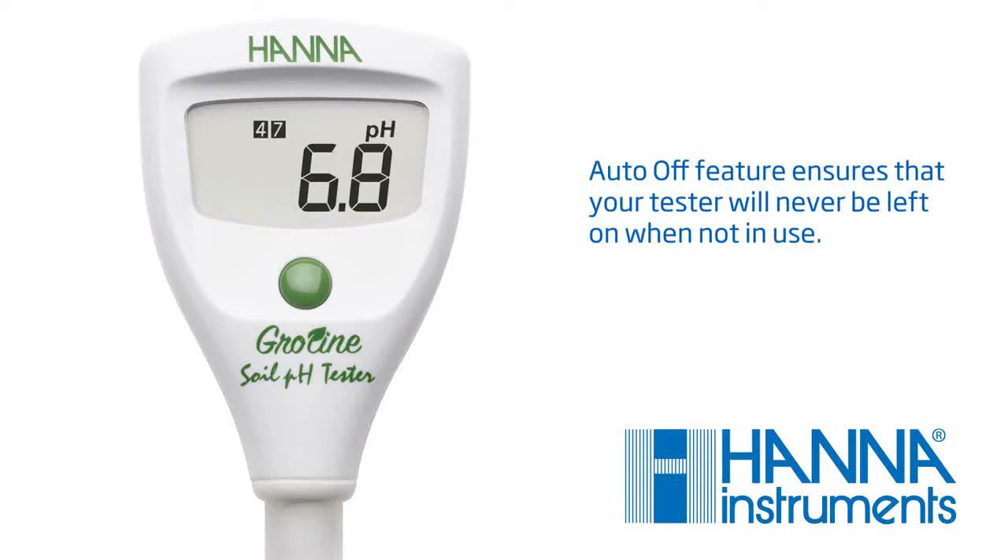You are now ready to begin calibration. Calibration is an important step in ensuring accurate results. We recommend calibrating before each use.